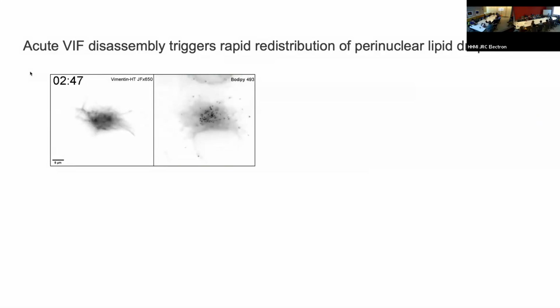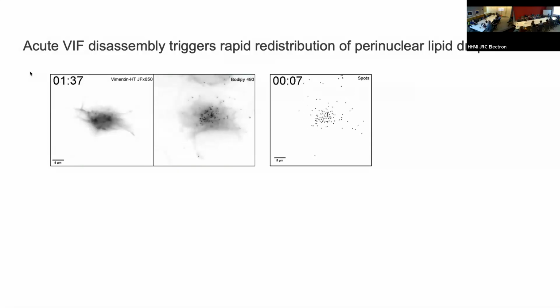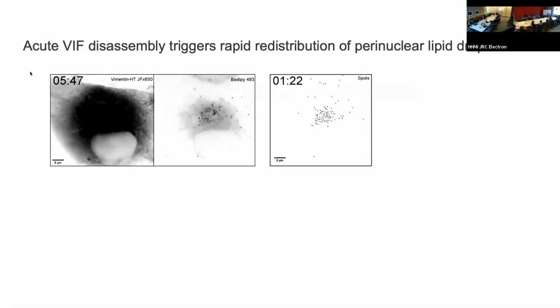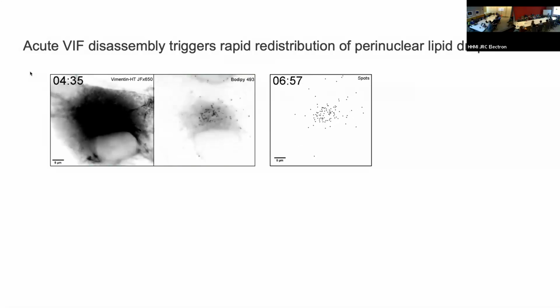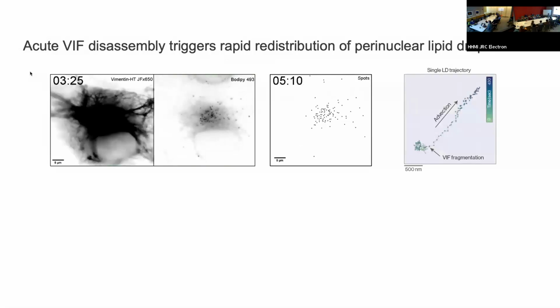So they lose their vimentin-dependent confinement, which maybe is also obvious in this movie we have that's a binarized position of those lipid droplets over time. Now, only the lipid droplets that co-localize with vimentin undergo that shift in position. Those that were trafficking out in the periphery do not. Again, supporting the idea that loss of IFs is associated with the change in localization.